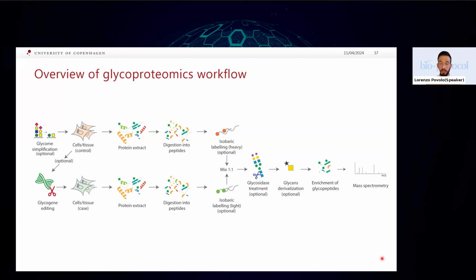I'm not the right person to do that, but I think also looking at the large amount of data that you can get from mass spectrometry in the correct way is crucial to have the information that you need and that can be biologically relevant. I would say these two points are the most crucial.